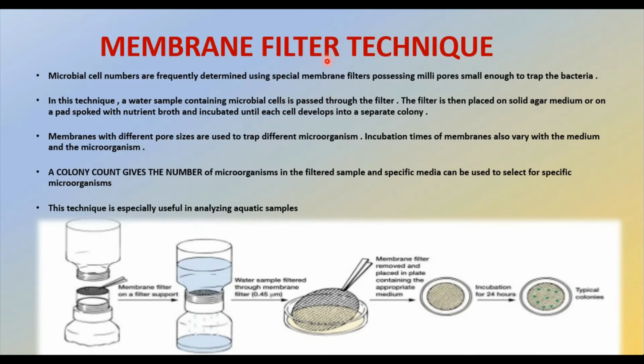And this is one of the few methods that allow the isolation as well as the enumeration of microorganisms. That means we can isolate the microorganism as well as count the number of microorganisms by using this membrane filter technique. Okay, what we are doing in this technique?